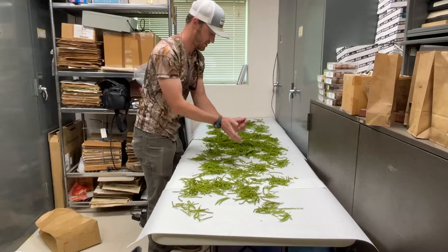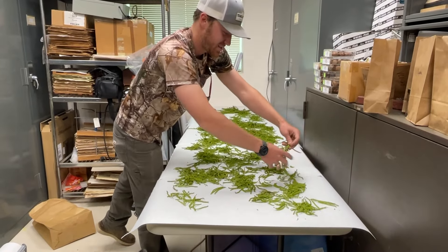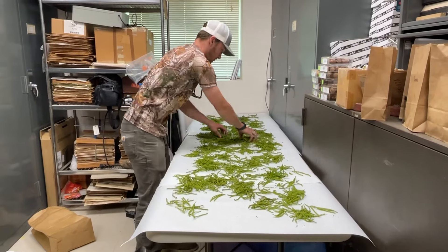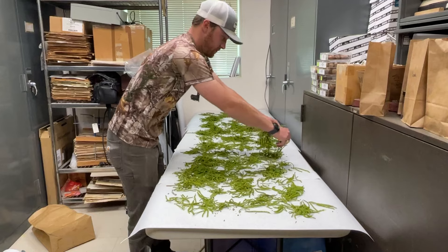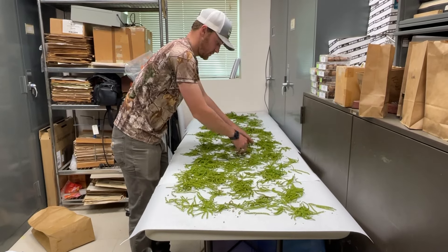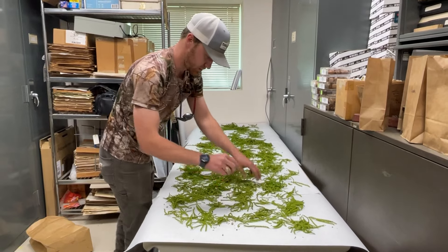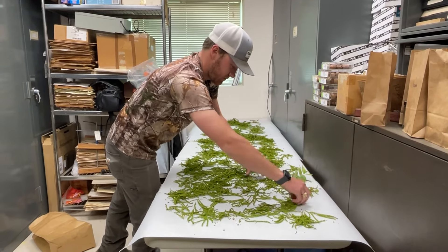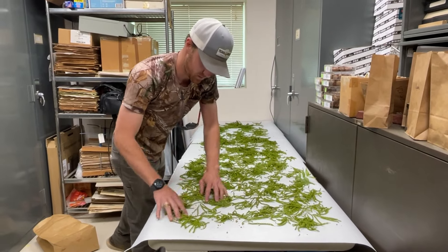If we have an eight-foot table like this, half a bag of catkins normally works well to get an even layer. If they were at the perfect stage and we needed a large collection — say 100 mils — we'd double that. This batch may not dehisce as well because it's a little bit early, so we may not get the quantity we want. That's why we didn't grab all the catkins off that tree — we wanted to save a few for backup.